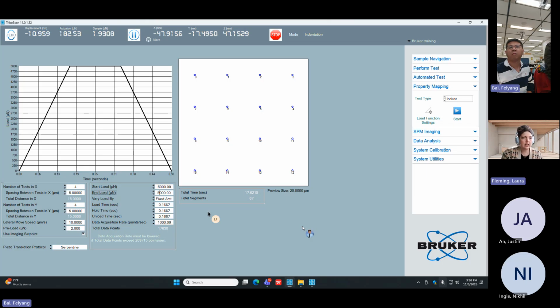It also means that with method automations, the grids can be as big as your sample zone. You're not limited; you're limited by the stage. You can do different methods that you can chain together. Sometimes it's just a little bit more repeatable because it's slower. It's a little bit less finicky because it's slower.